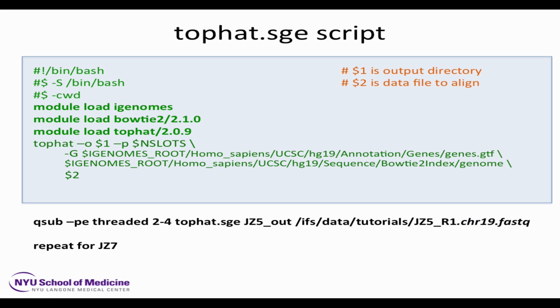Also, when we do the downstream analysis, if you were to do a GSEA or a GO analysis to say what families of genes and pathways are overexpressed, it may not work very well because we only have genes from chromosome 19. Also, if we load the aligned reads into a genome browser, we should only see reads for genes on chromosome 19. The other chromosomes should be pretty empty.